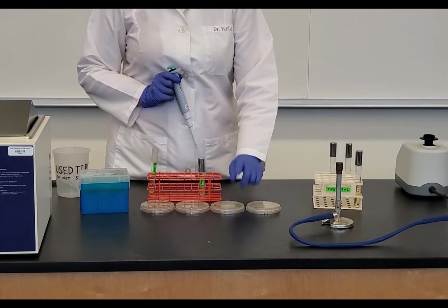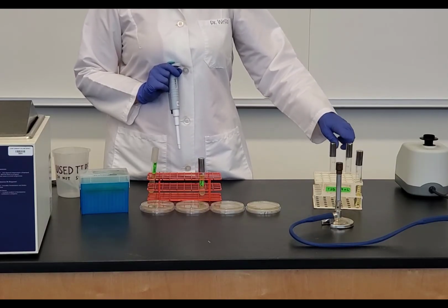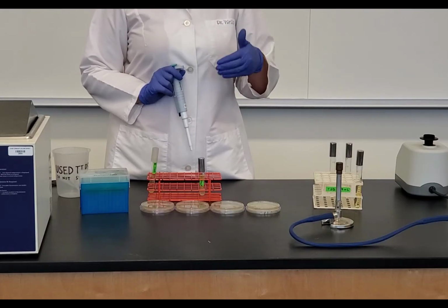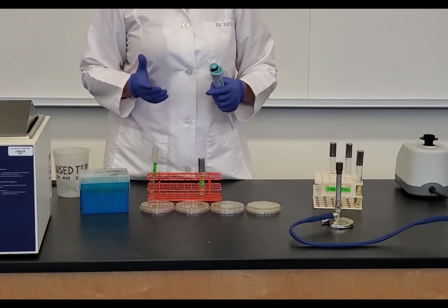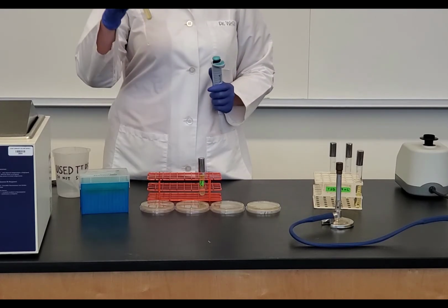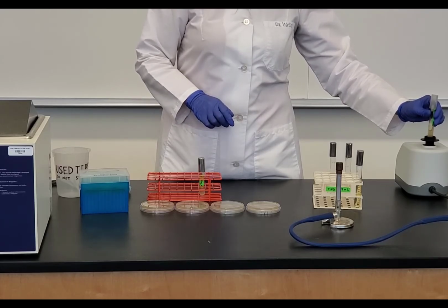Now, let me explain what I'm going to do for my 10 to the negative 5. For my 10 to the negative 5, I have my serial dilutions. And again, I'm going to take 100 microliters from my 10 to the negative 4. And I'm going to add it to the melted agar deep. But again, I can't just add my virus, because if I add just my virus, then it's not going to grow. So in my melted agar deep, I'm going to add the virus, and I also need to add my E. coli. So this is my E. coli. Again, I'm going to vortex this, just like I did for the phage.